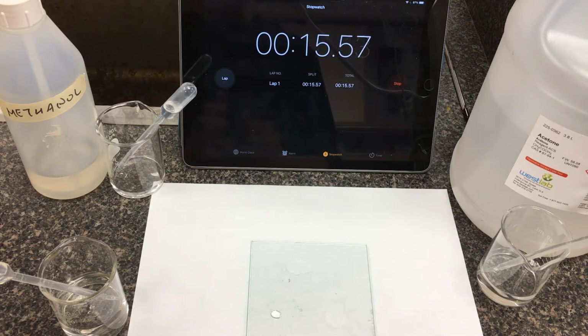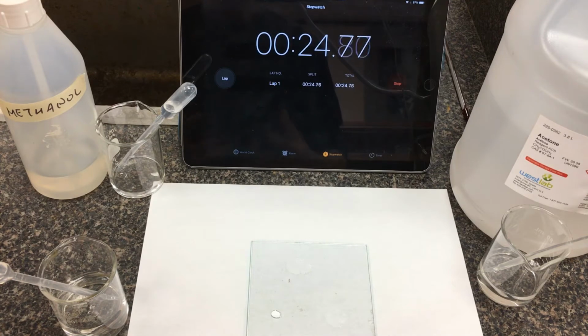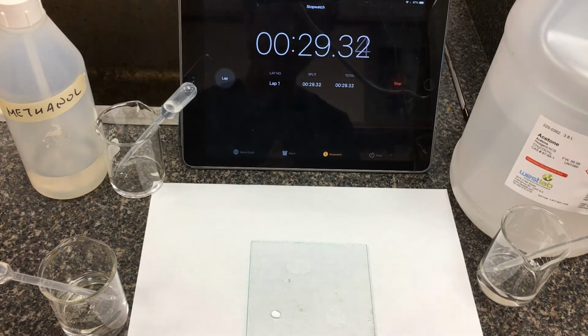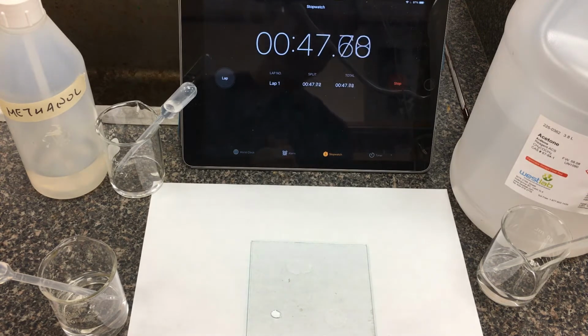Although I did try to have just one drop of each of these solutions, both methanol and acetone have trouble holding onto these droppers. As a qualitative comparison of the intermolecular forces here, I'll give you an observation of when it looks like these solutions have disappeared. If the solutions have much stronger intermolecular forces, where the liquid-to-liquid strength holds itself together better, we would expect they would evaporate a lot slower. So at this point, we still have acetone, methanol. Our water droplet is still holding its shape very well.